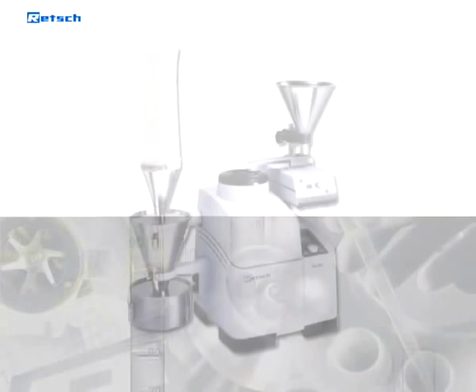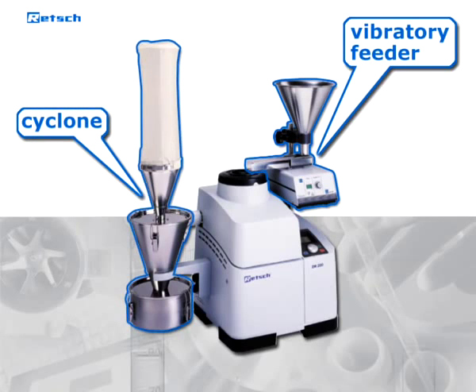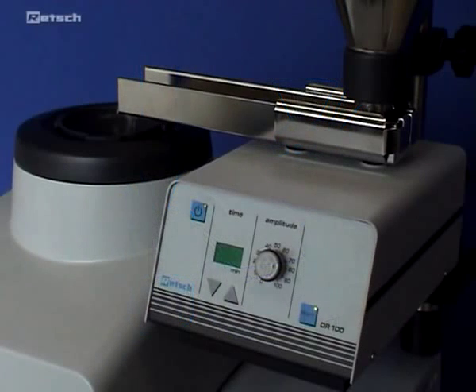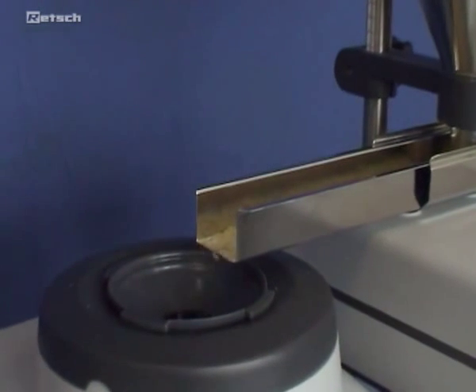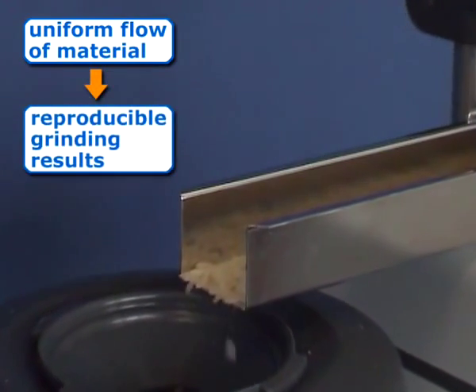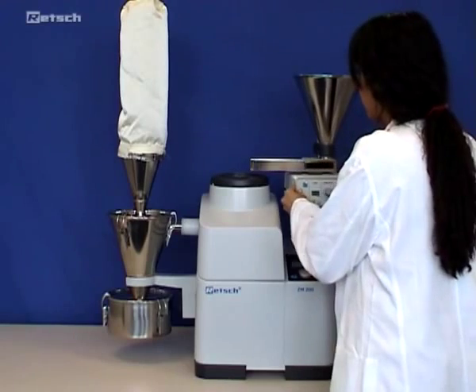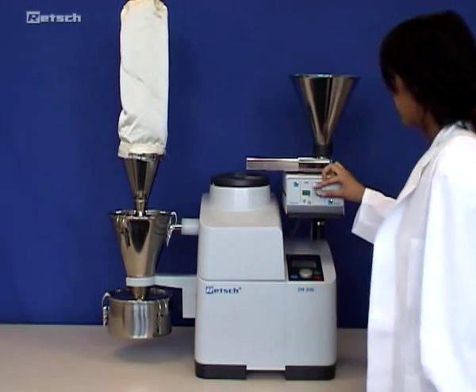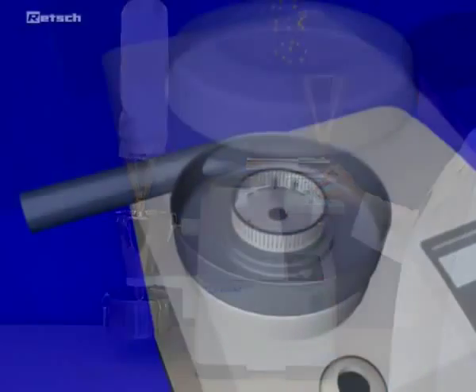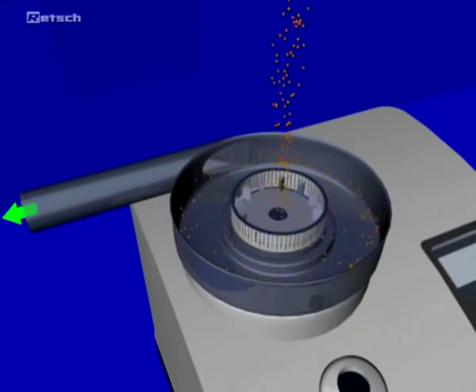To further simplify and optimize your comminution process, a vibratory feeder and a cyclone are available. Automated sample feeding via the load-controlled vibratory feeder DR100 guarantees a uniform flow of material and therefore reproducible grinding results. Moreover, for grinding larger volumes or samples that are sensitive to heat, we recommend the use of cyclones. The airflow generates a cooling effect and discharges the sample more quickly from the grinding chamber.